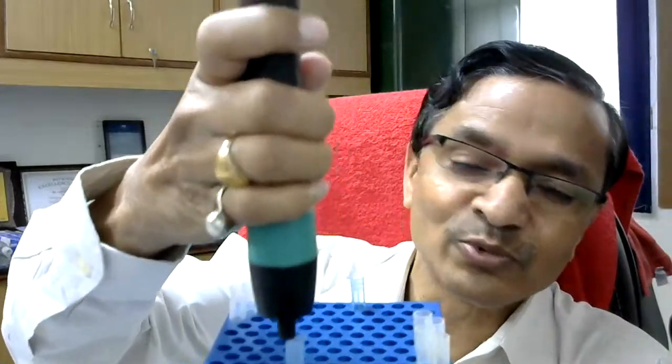You have to put the pipette on the tips and take the tips. Whenever you are using a 1 ml pipette, you have to use blue tips, from the tip box. Generally, we fill the tips here and autoclave them so that the tips are sterile.